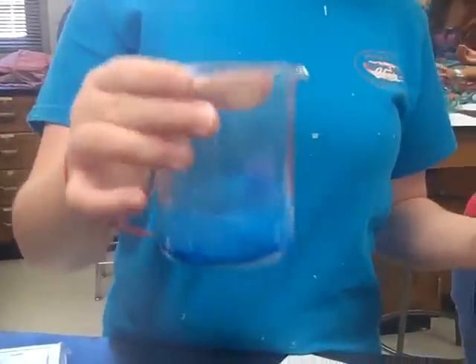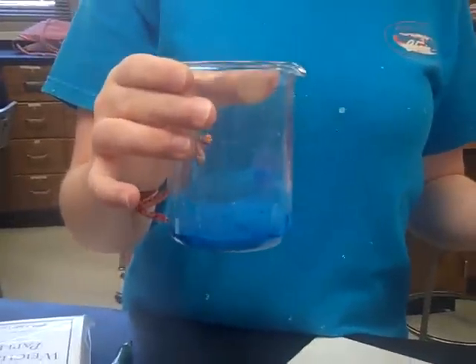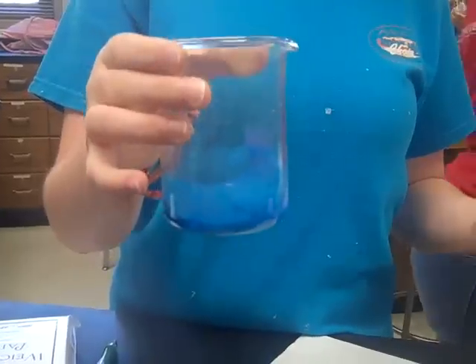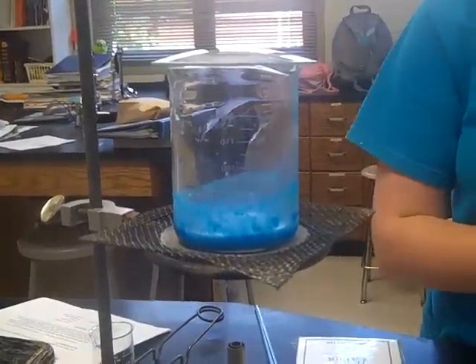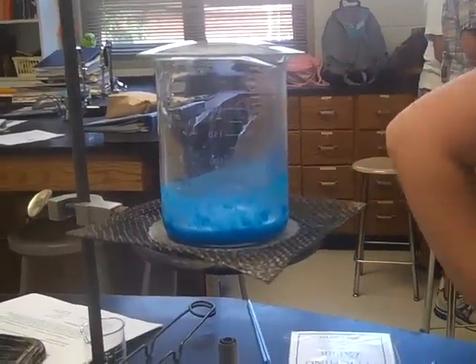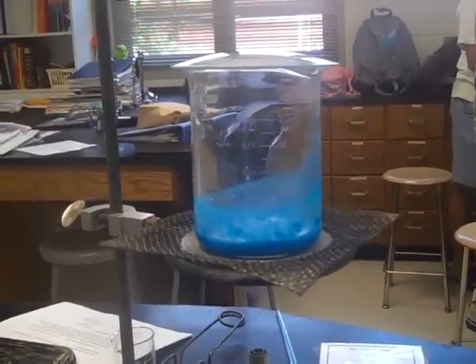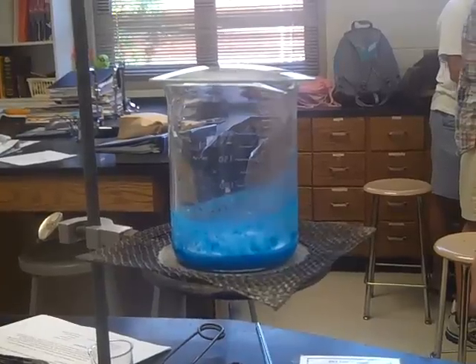Here we have this mixture of copper 2 sulfate pentahydrate and 6 molar sodium hydroxide. We are going to heat it over a Bunsen burner and put the watch glass over to reduce splattering. Over a period of time it will decompose into copper 2 oxide and water.